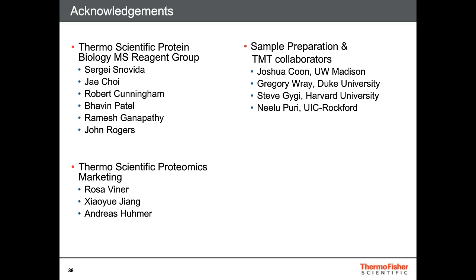But for low resolution instruments, you can actually still do TMT quantitation, but you would be restricted to using the 6-plex. Those tags have unit mass Dalton resolution, so therefore they can be easily measured on a low resolution instrument, such as a Velos or a regular ion trap or even a QTOF instrument.